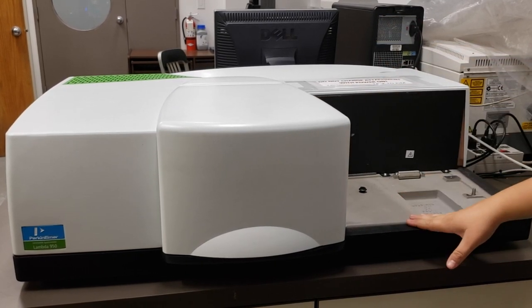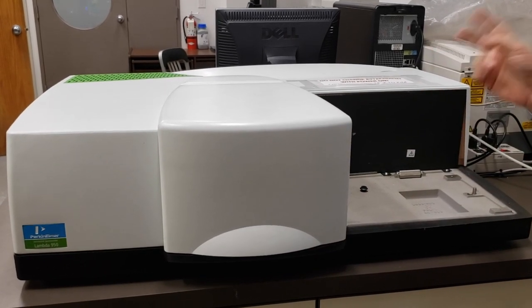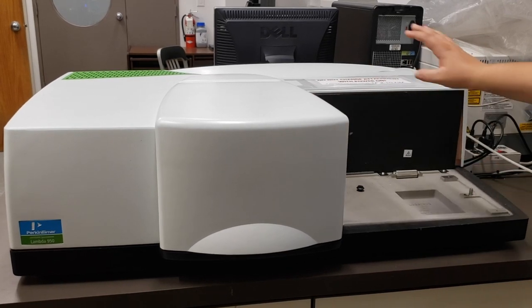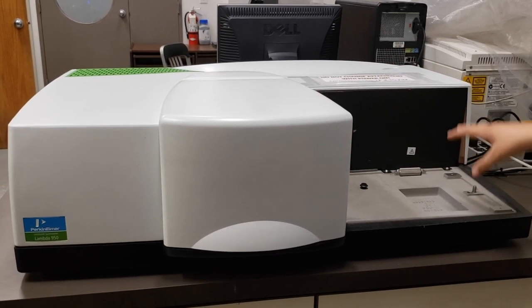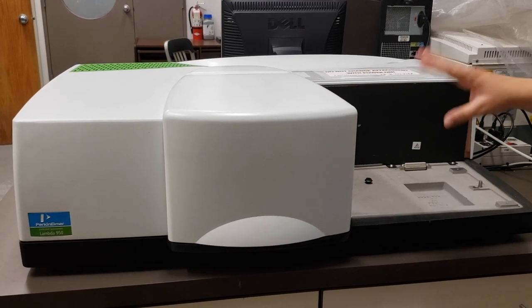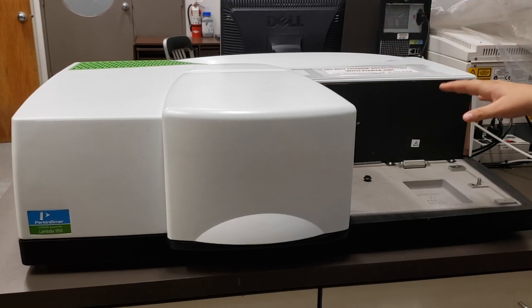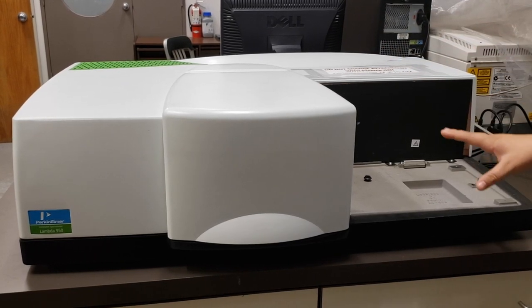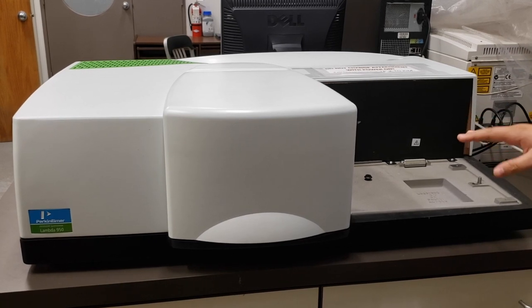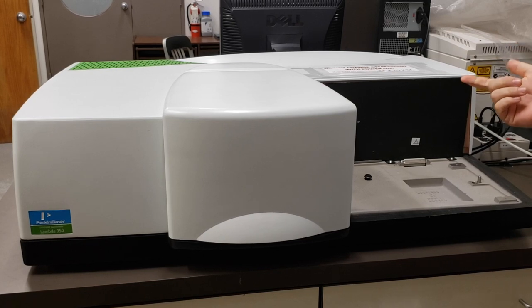The other two detectors — the integrating sphere and the universal reflectance accessory — actually have additional optics and electronics within the detector to direct the light in different ways, where the 2D detector really just passively picks up the light that comes directly through. We have one main sample compartment and then the integrating sphere and the universal reflectance accessory, which have a secondary location where you can put your samples.